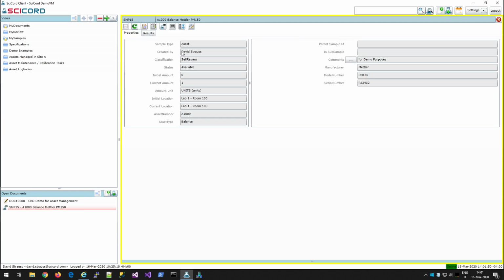Asset definitions include location, identification information, and status. The properties displayed on this dialog are configured to meet the needs of an organization. In addition to the basics, accounting information such as date purchased and PO number are often included. The definition information is typically static and not expected to change unless the asset is moved or decommissioned.